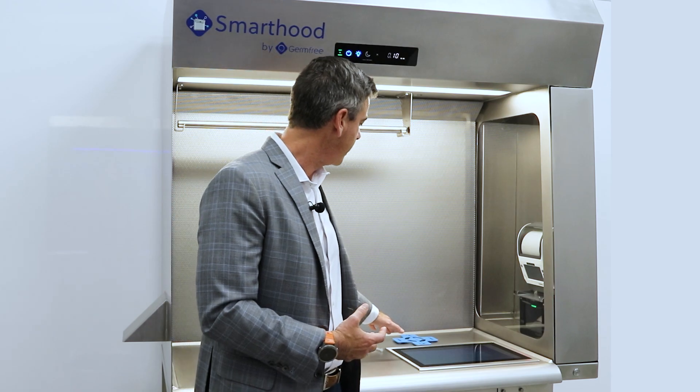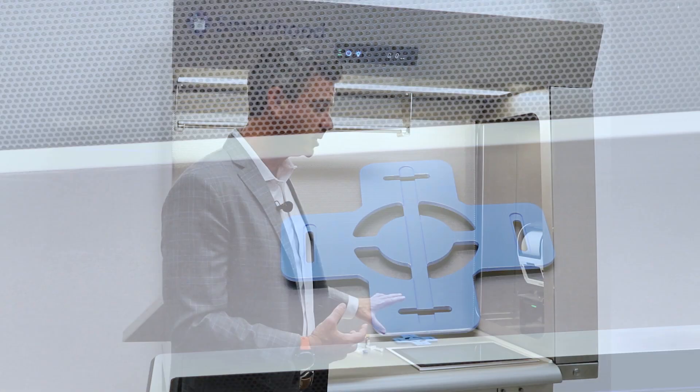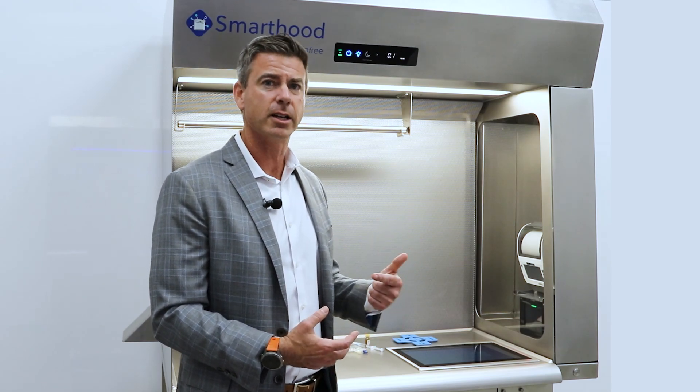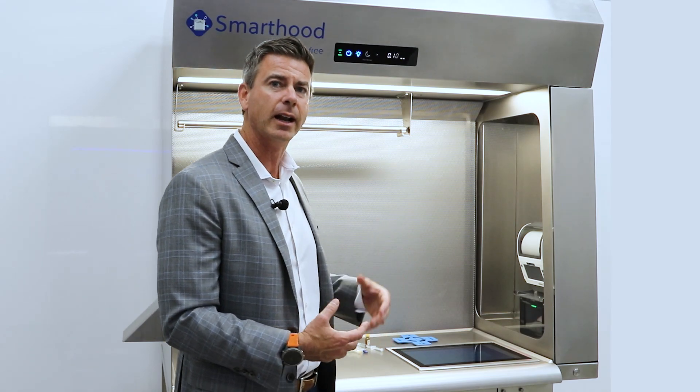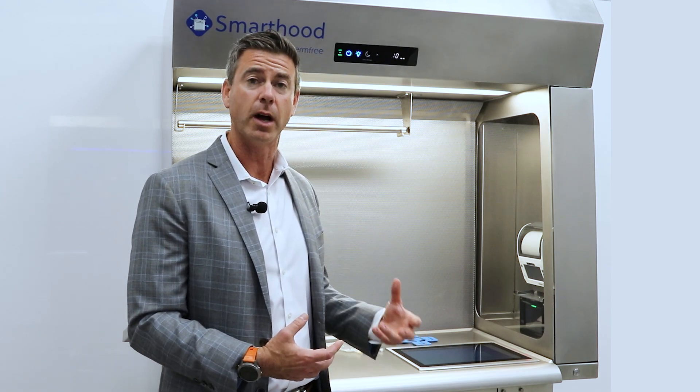We also have a Mettler Toledo scale, and that's actually positioned within the frame of the unit. So it's not going to catch vibration from the work surface and will allow you to get the most accurate gravimetric image possible.